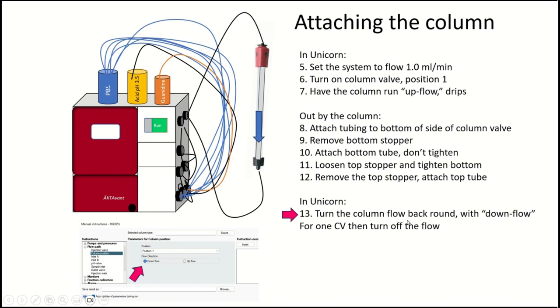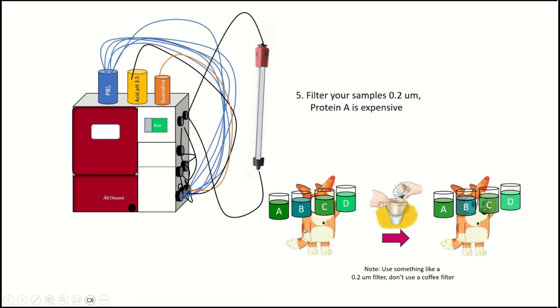Once we're done with that, we're going to remove the stopper and attach the top tube. Okay. Then of course there's one more step, which is we're going to turn the column valve back to downflow right here, downflow inside unicorn. Right. And that'll cause the flow to go in the proper direction. And we're going to let it run that way for about a CV. And then we're going to turn off the flow.